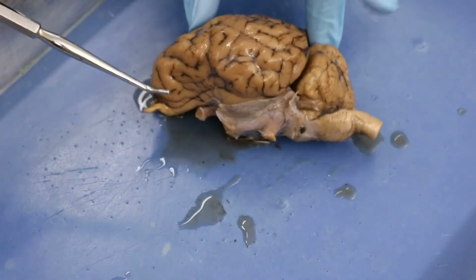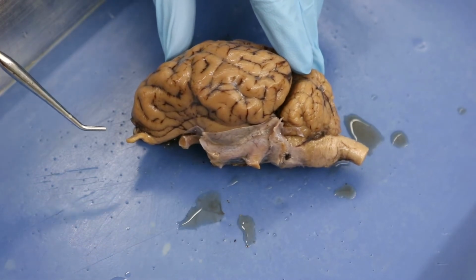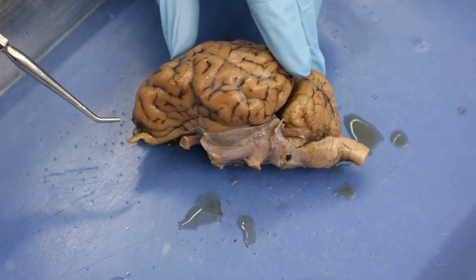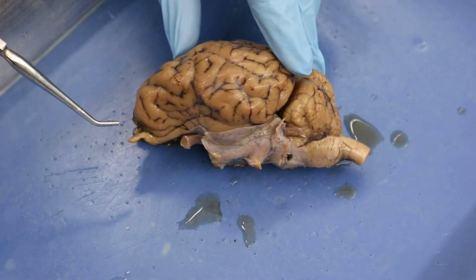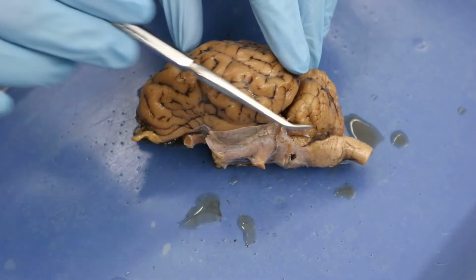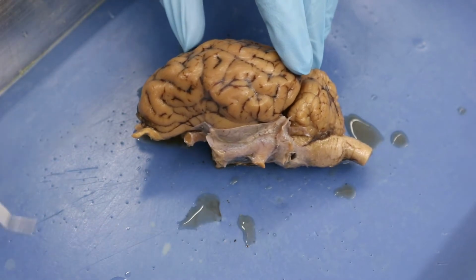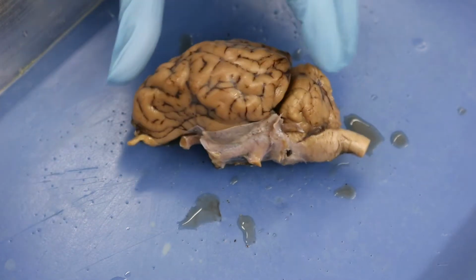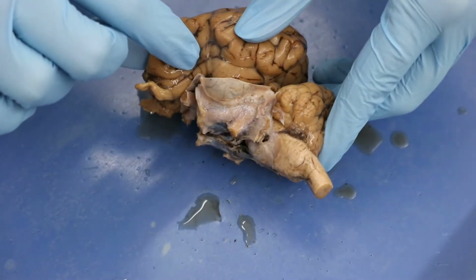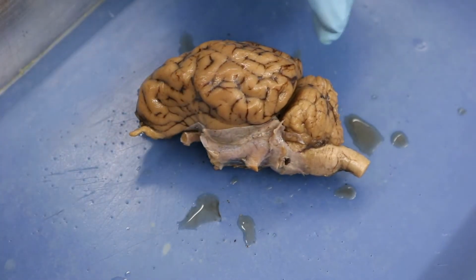Okay, so one thing you notice with a sheep as compared to a human, or hopefully you've noticed, but if not, I'll tell you right now, sheep walk on 4 legs and humans walk on, well, 2 legs, okay? So this changes the orientation of the brain. You can see that their brain is basically one long line. But for us, you guys have been looking at the model, so you already know that our brains are shaped more like this, where we have this section bent down because we walk on 2 legs, okay?